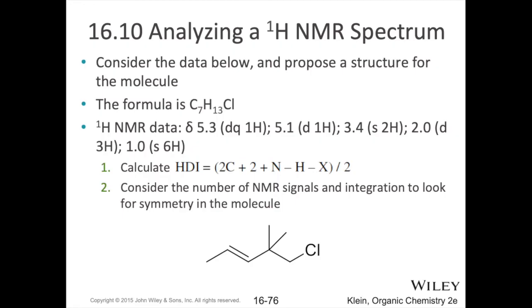If it's more difficult to go from just a list of peaks and try to create a molecule from this, you can work backwards and look at your answer choices, which are molecules, and ask yourself what the peaks, the signals for that molecule would look like, and then see which ones agree with the question.